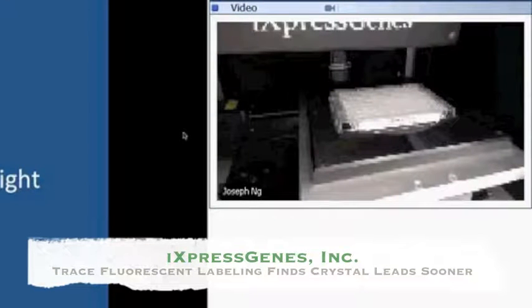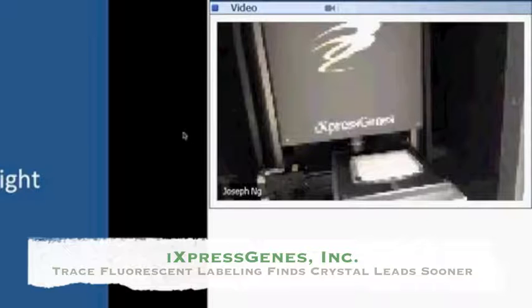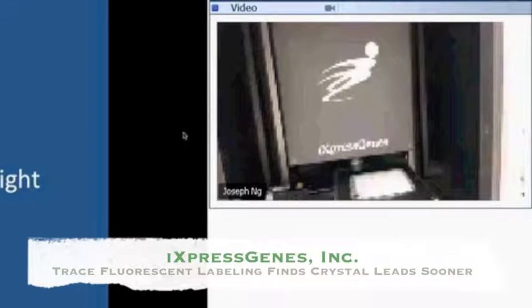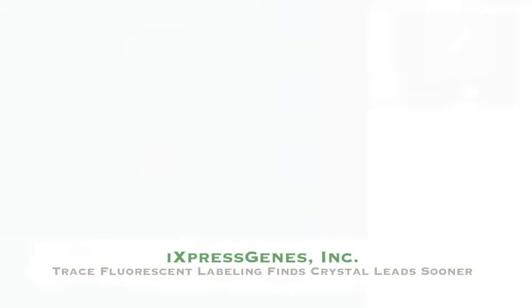So here you see the yellow light, the green light, and we're looking at different complexes. You can see the white light. So you have all different pictures to compare it with. So this is our concept. This is an automated machine that allows us to screen things very, very rapidly.